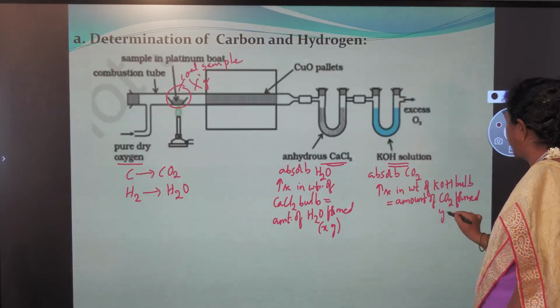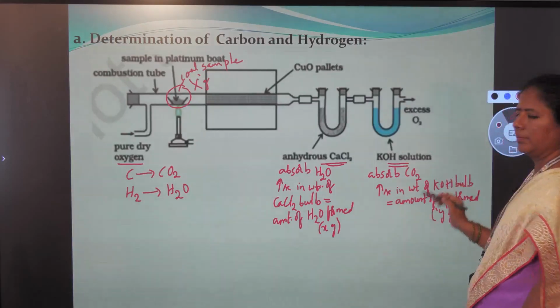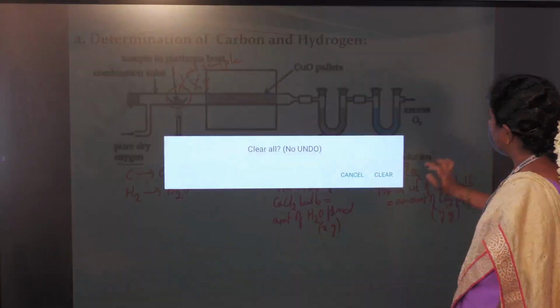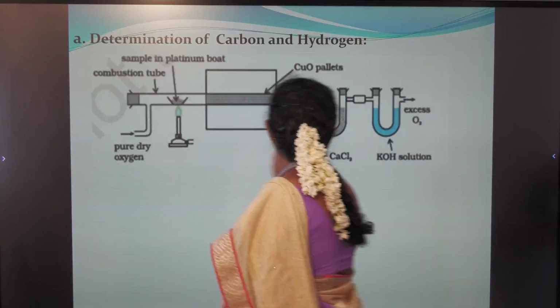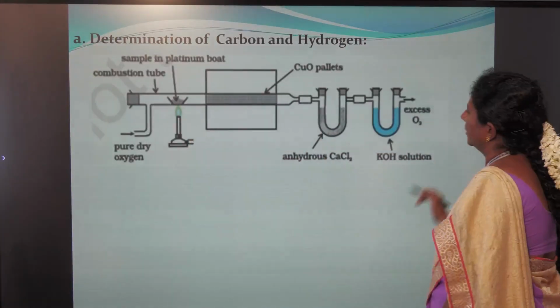Let it be some y grams. Now I will tell you the determination of percentage of hydrogen and carbon.